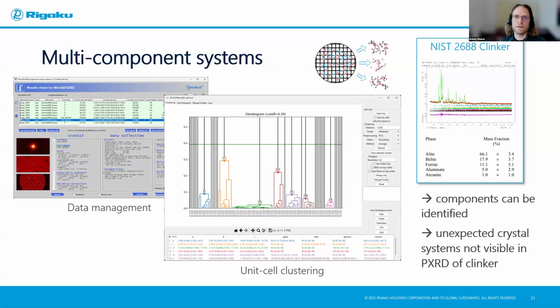That's a good point. I think the underlying problem here is that still mostly just X-ray codes are used for the refinements for electrons. And these electron-specific extensions, for questions like this one, where you need to be more rigorous with the statistics for the lower signal-to-noise ratios you often have with electrons, first need to be incorporated.